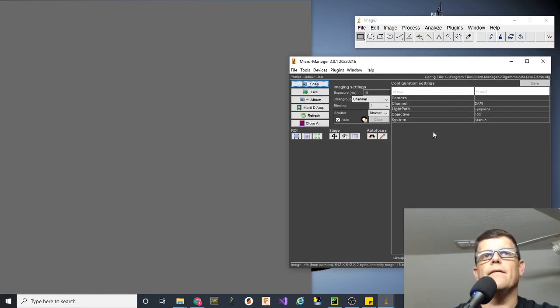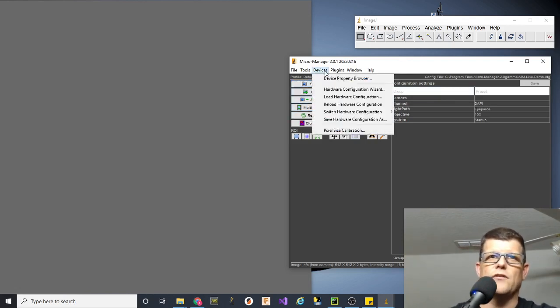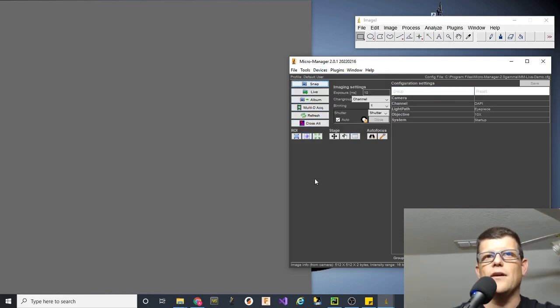All right, with this done, the next thing I'm going to do is try to directly control the Triggerscope. Now, if you got this far, it means that the driver is talking to the Triggerscope. Really, as soon as you load up the hub, if the hub runs through properly, then you know that the driver and the firmware are working properly and talking. So that's good. But now I really want to test it, make sure things are working.